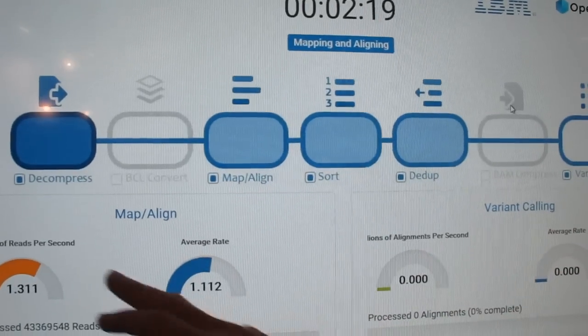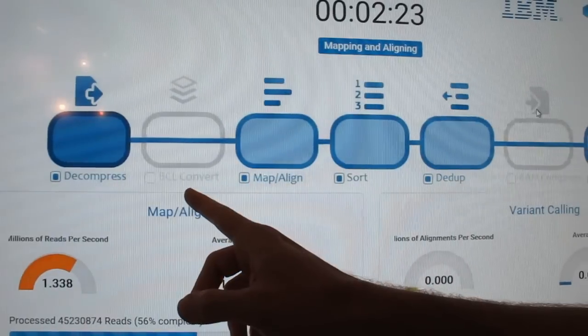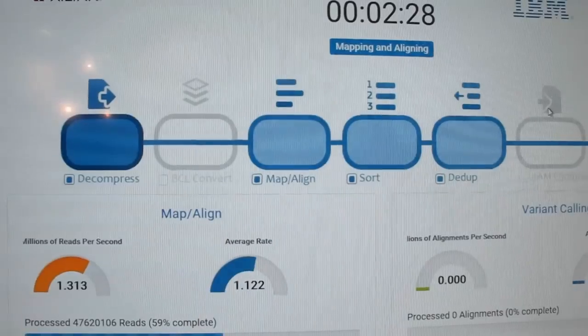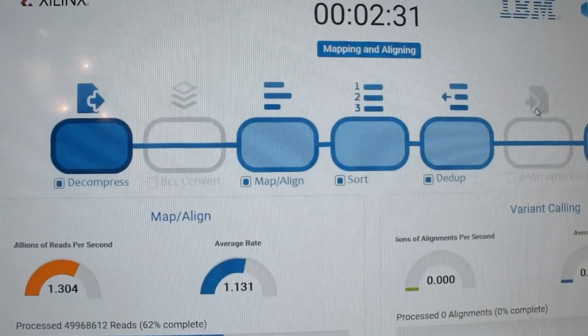For here, we're doing the decompression of the data coming off the sequencing instrument. On an exome, you're looking at around 30, 40, 50 gigabytes, depending on how much your coverage is. For a genome, it's about 200 gigabytes.